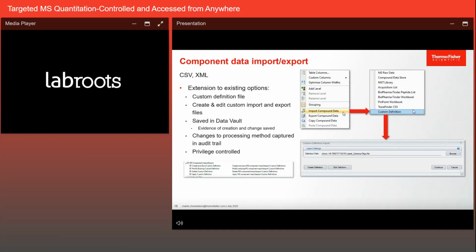As there are many different types of mass spectrometers which are in use with Chromeleon, one issue we continually faced was supporting all of the different drivers and acquisition modes that were available. So often new drivers were developed where the import and export type was redefined to better support the workflow at that time. But this caused issues when doing certain aspects of data processing.